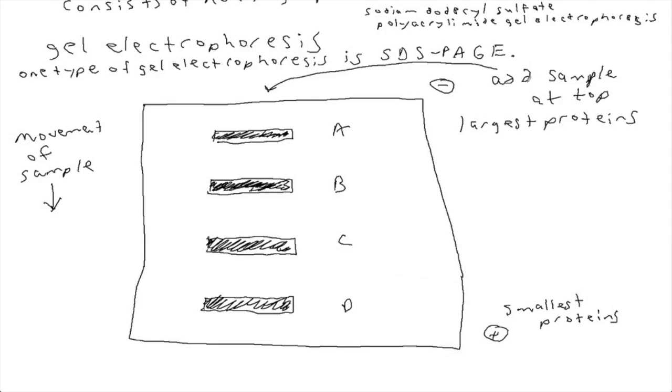Excellent. That's right. So the big thing that's new here is that we're using the sodium dodecyl sulfate. Not all types of electrophoresis use sodium dodecyl sulfate, but this type does. Do you remember what was the purpose of using the sodium dodecyl sulfate? How does it function in the electrophoresis? Isn't it negatively charged? It breaks down the proteins and binds to them. Good.